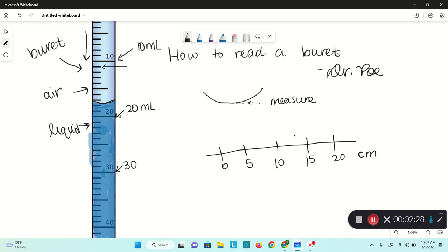It's the same thing here, but we just flipped it up on its end so that the zero's at the top and the 20's at the bottom, and the 10's here, and this would be 15, and this would be five. It's the exact same thing going from the top down, just think of it like a number line.